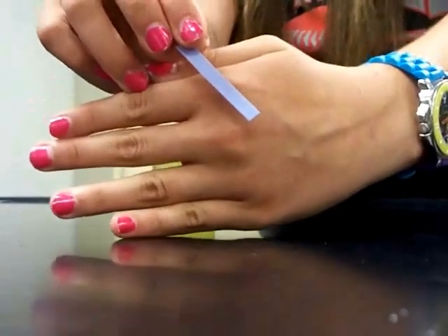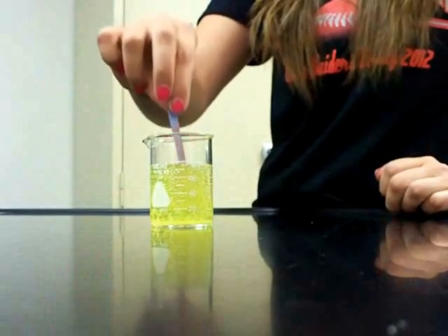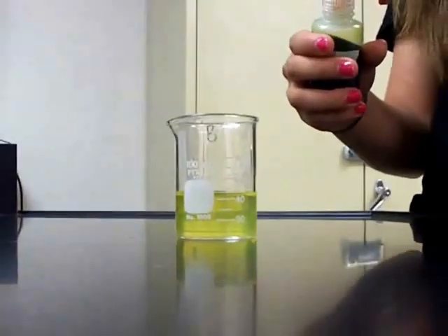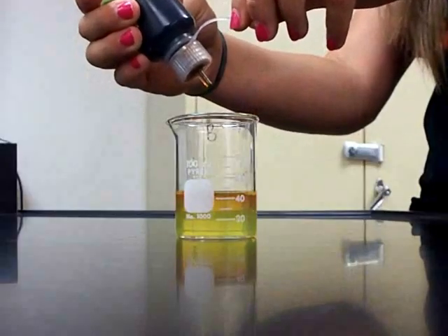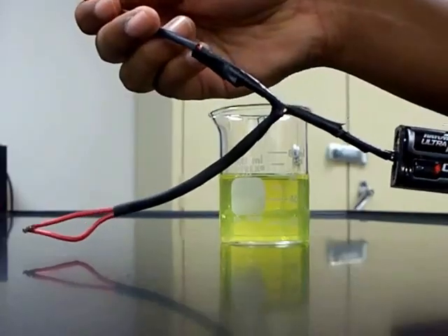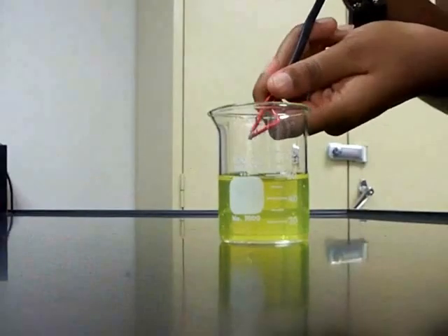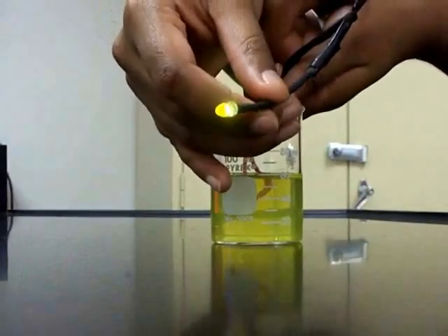This is blue litmus paper. As we dip it into the Mountain Dew, we can see that the color changes to red, indicating that it's an acid. This is the universal indicator. As a few drops go into the Mountain Dew, as you can see, it immediately turns red, indicating that it's an acid. Here is the conductivity tester. As we put it into the Mountain Dew, we can see that the light has turned green, indicating that it's an acid.